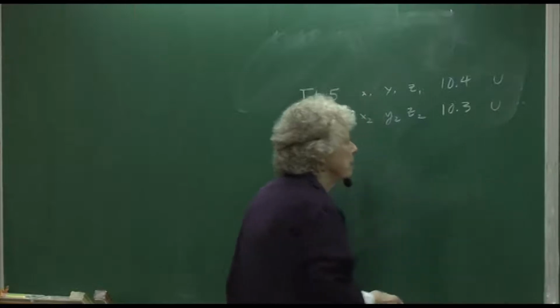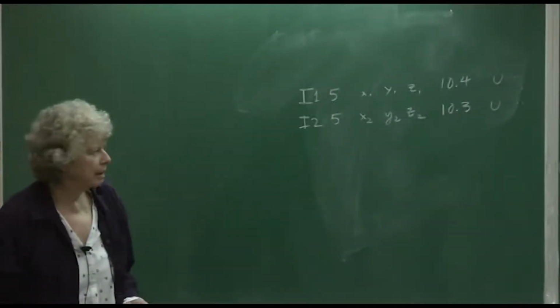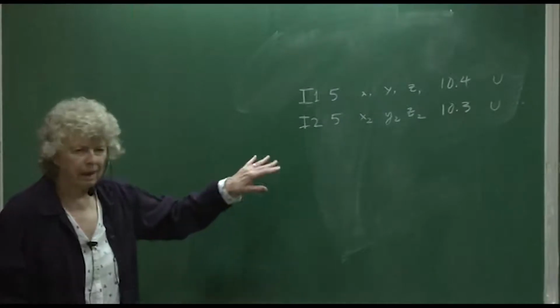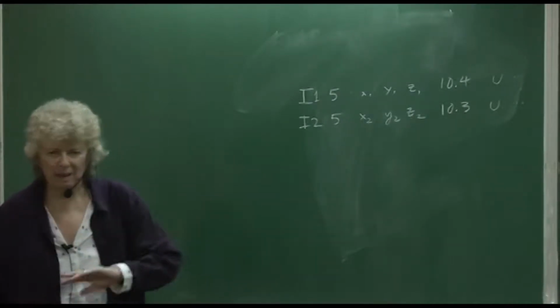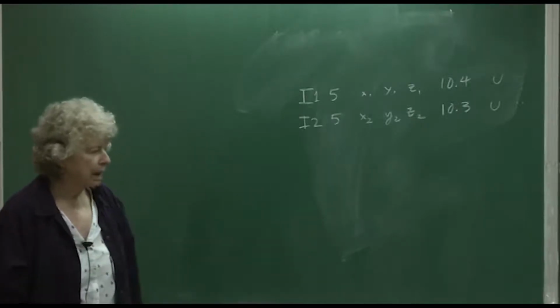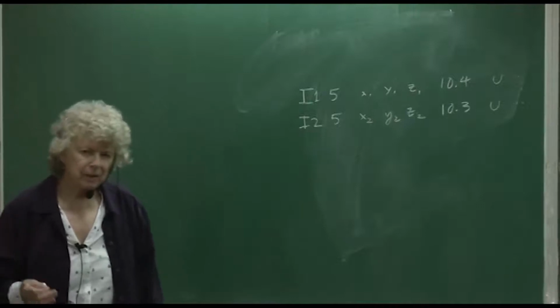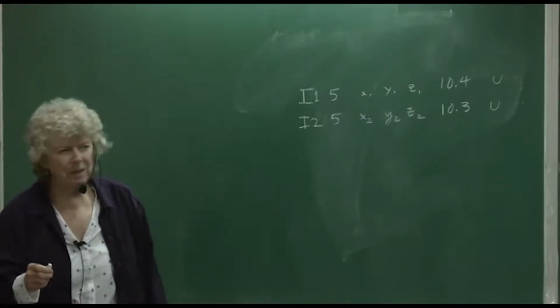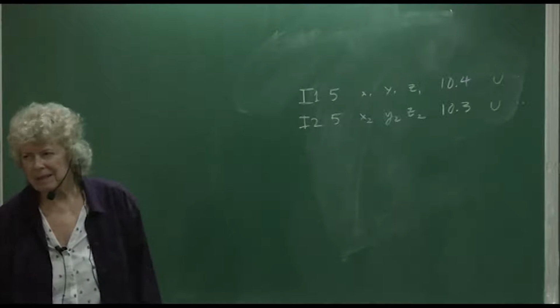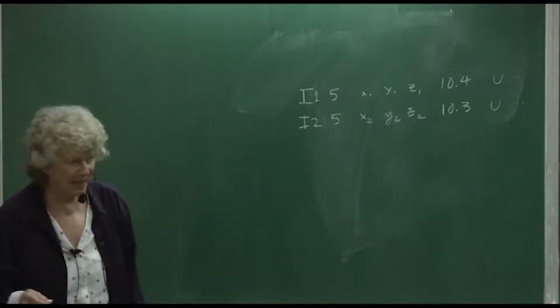But then you've got a lot of other atoms that are full occupancy. But something happened to the iodine, I don't know, it got oxidized, it left or something. Or maybe there's another one somewhere. But how do you find out what the actual formula is so you know what the Z is? Because the Z is the number of formula units. So how do you know the formula? Sometimes it's really tricky to figure this out.